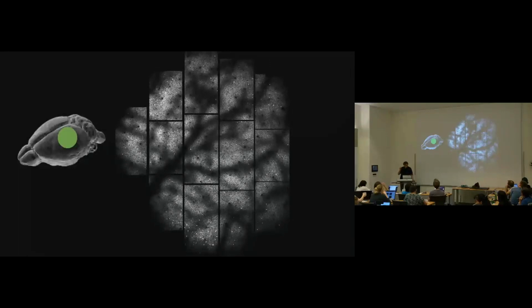And even if you're going to a different species, well, zebrafish, you'll have maybe something with very dense labeling of cells. That will be maybe similar to mouse hippocampus, where the cells are also quite dense. So that's maybe a slight change, and actually there's a whole team we put together, Team Dense Recordings, that's just to investigate what are the best settings to use in that situation.